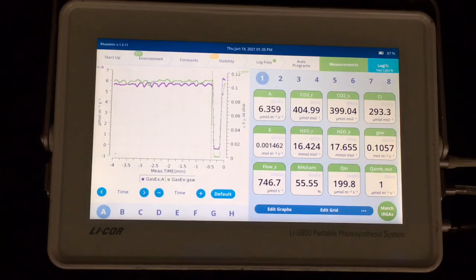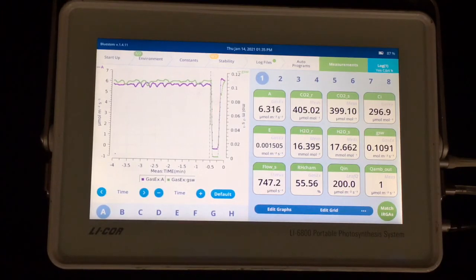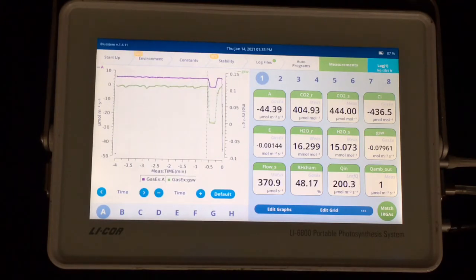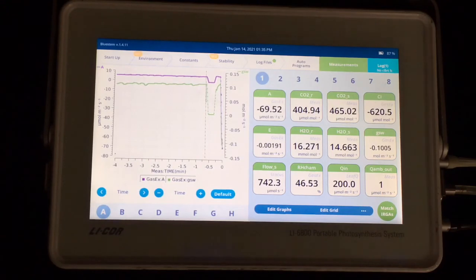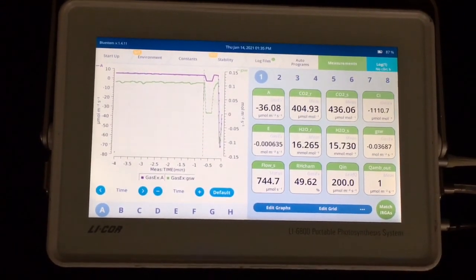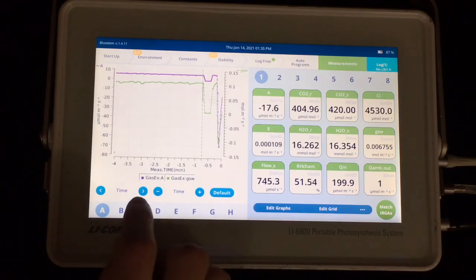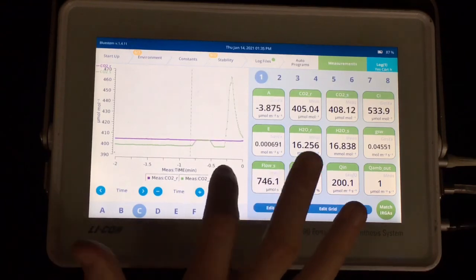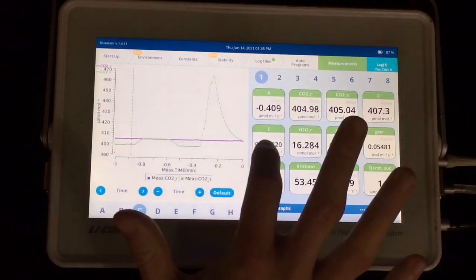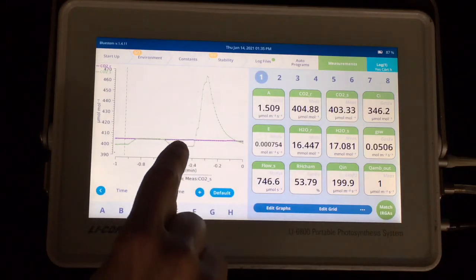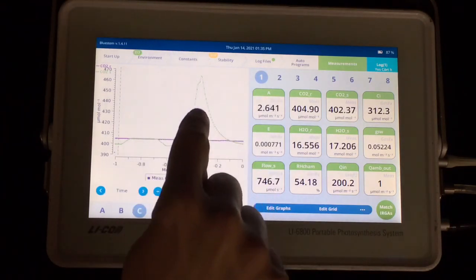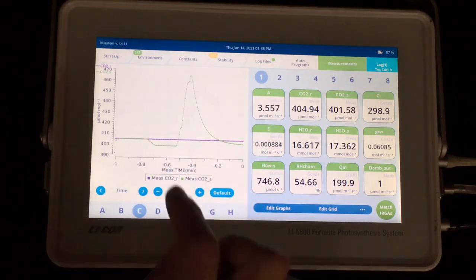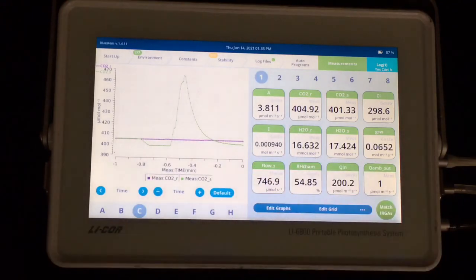And let's look what that looks like real quick. So I can unclamp. And then I can move to the next leaf and reclamp. And this can help you. Now you'll see as that chamber is flushed you can kind of look at some of your other graphs. For example you can watch the CO2 concentrations. And you can see my CO2 reference which I'm controlling on didn't change at all. But when I opened my chamber there was a big rush of CO2 from this room that I'm in. Where the concentration is higher. And now as that chamber flushes I'm getting closer and closer to stability.